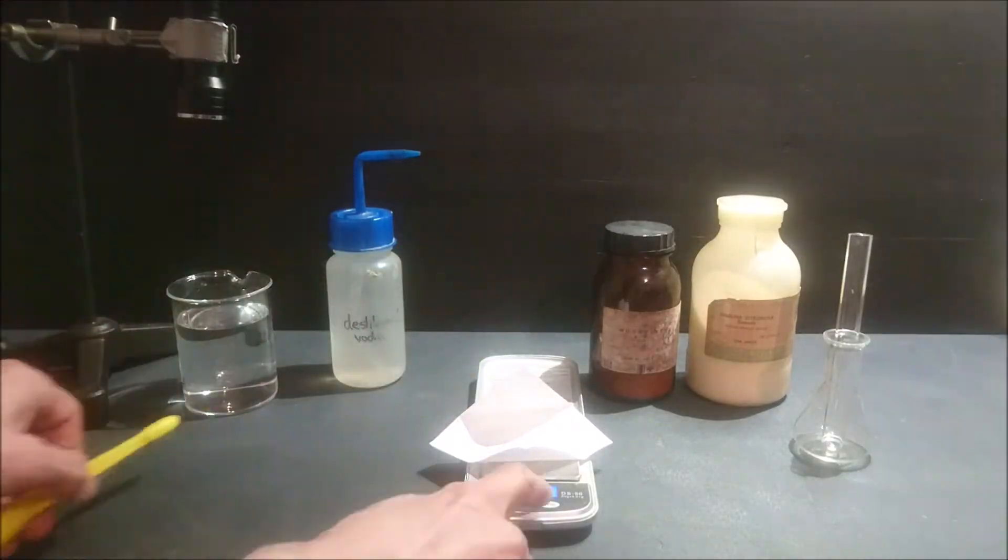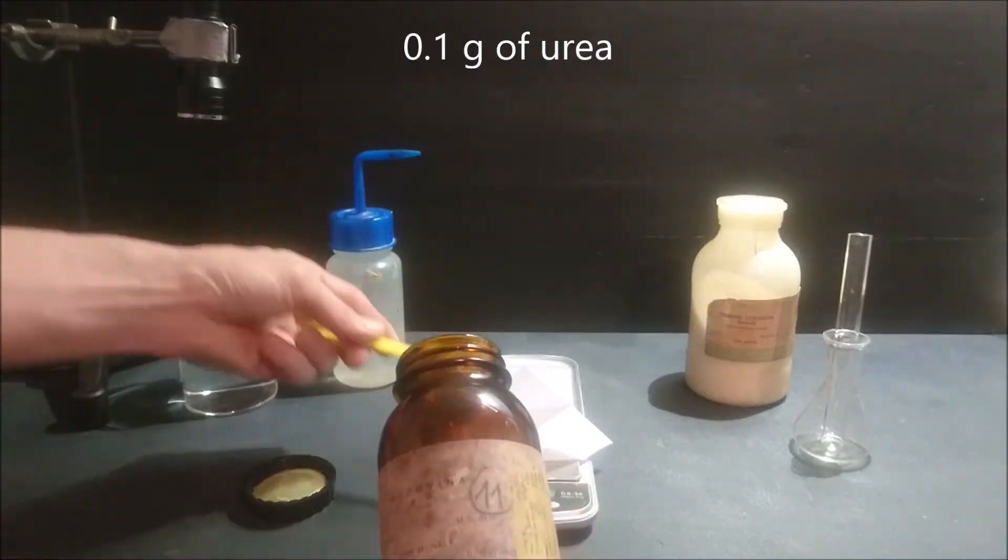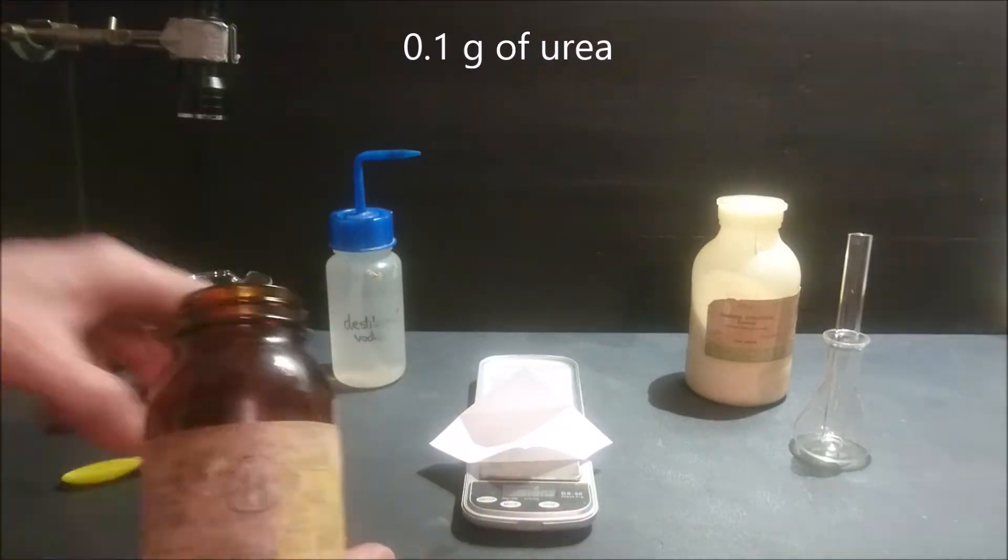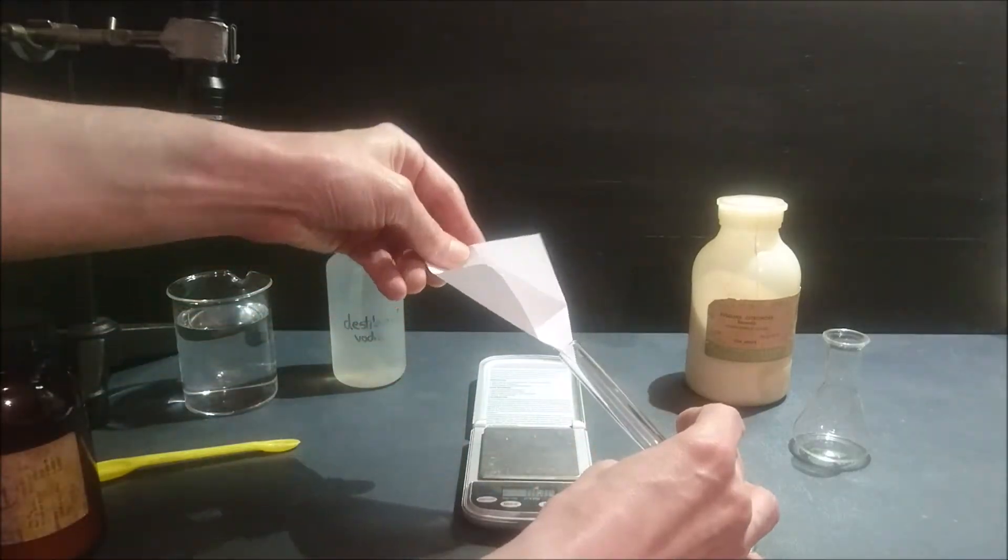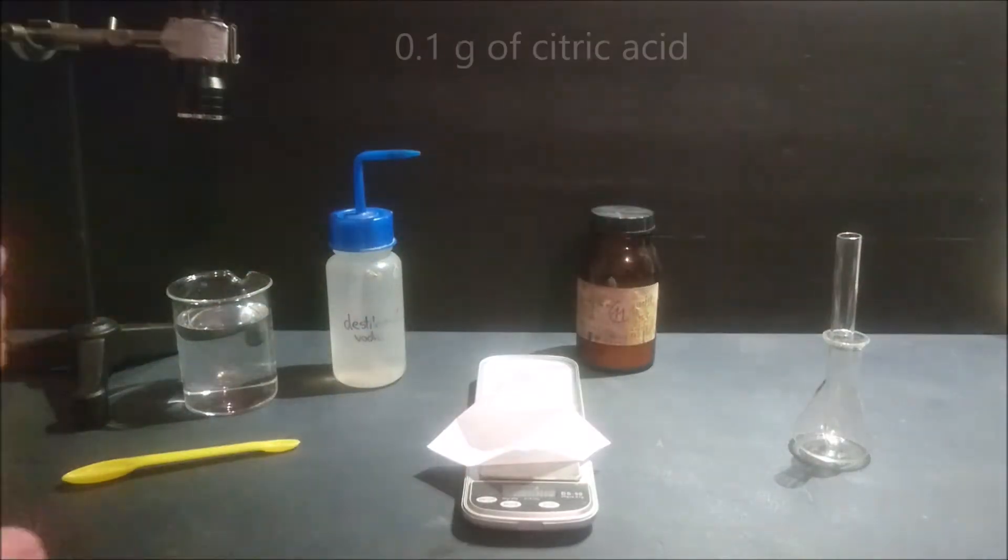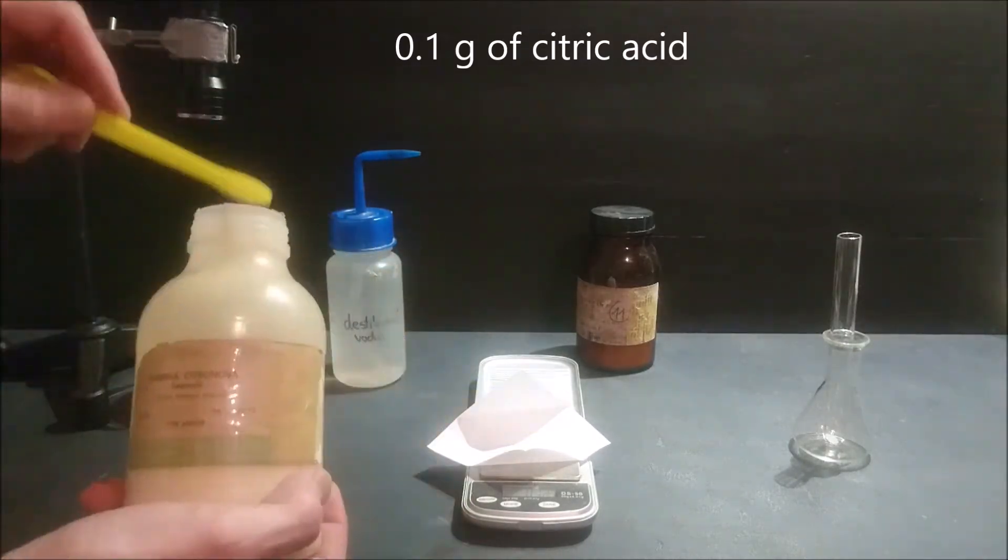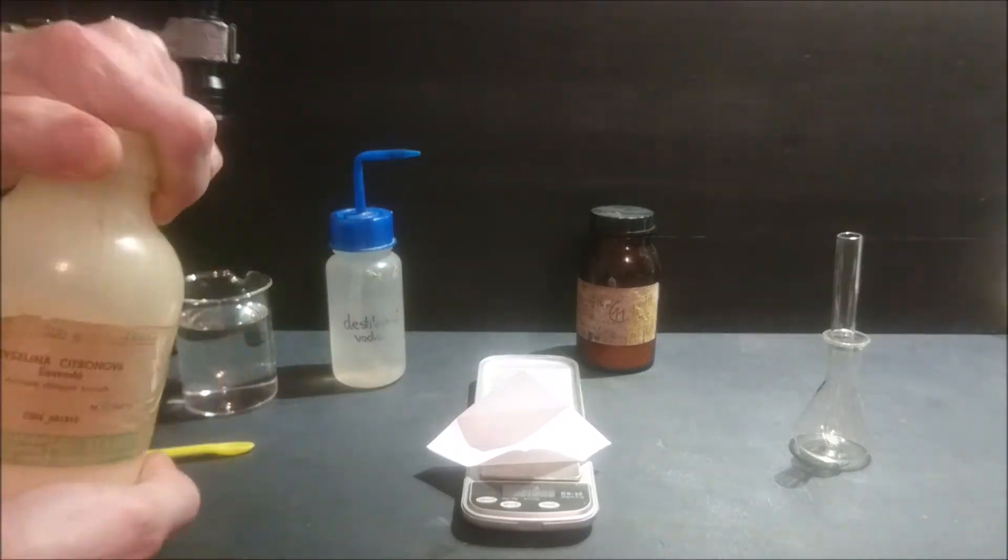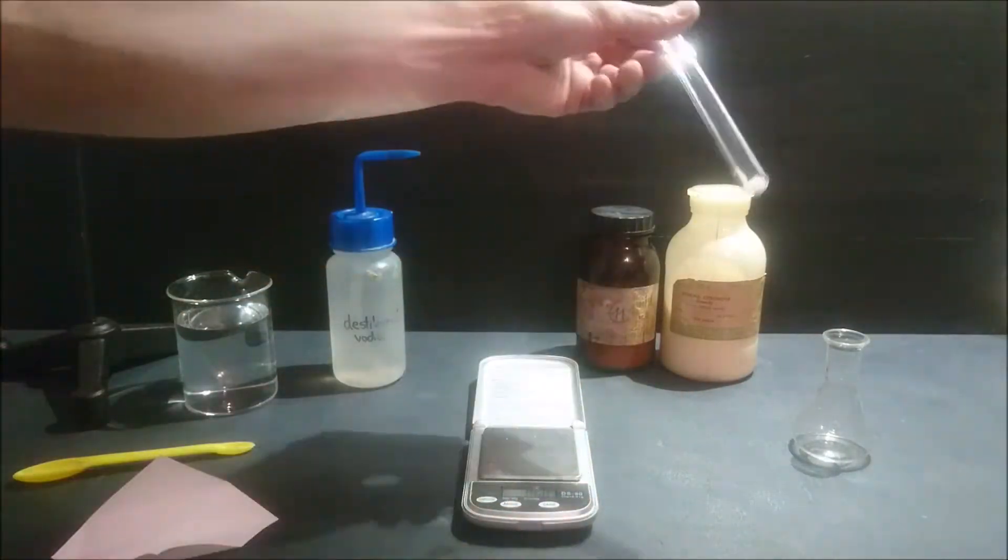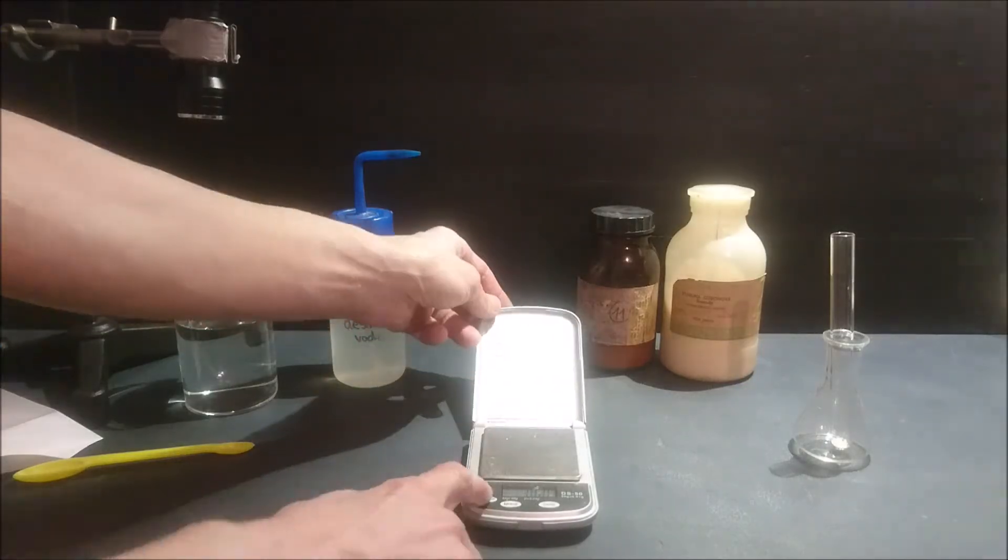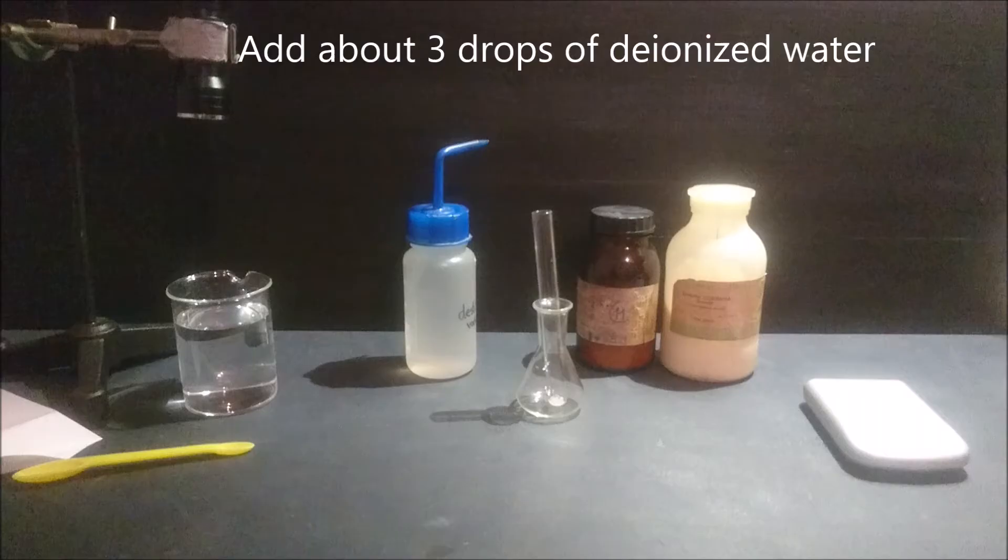Weigh about 0.1 grams of each reagent and add them into a test tube. Moisten the reaction mixture with about 3 drops of deionized water.